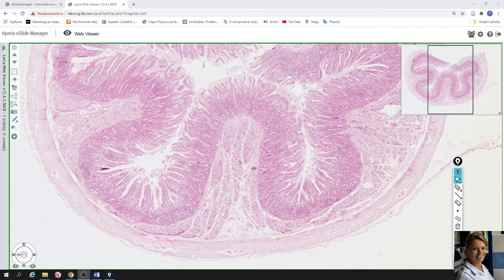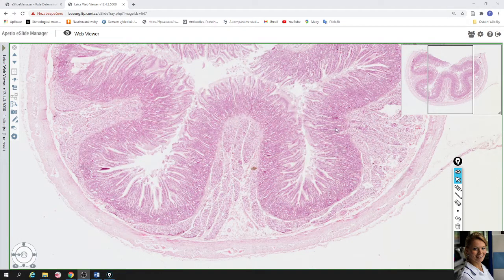The wall of duodenum consists of four layers. The first layer from the lumen is called mucosa. It is here.